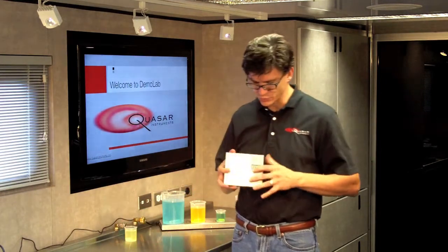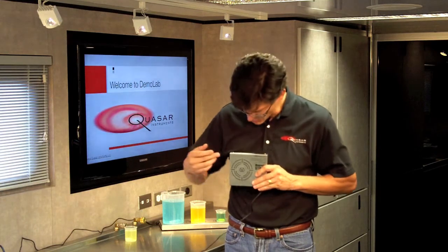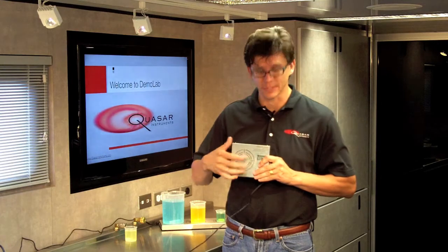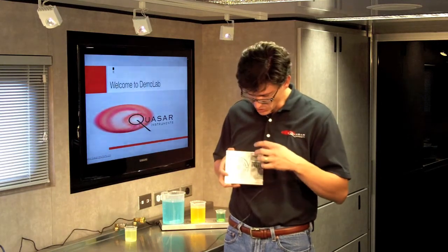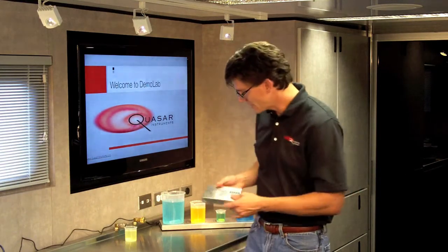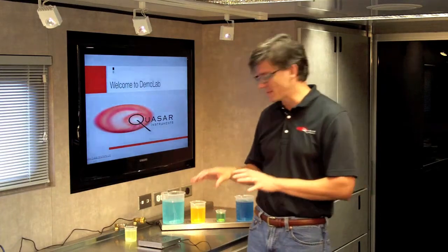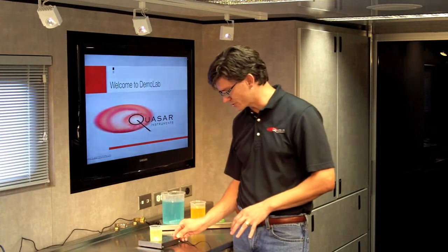What Hanil has done is replace the traditional motor magnet mechanism with a series of electromagnets located throughout the unit. They then use an electronic control box which controls the magnetic field at each one of those electromagnets, and directly manipulate the magnetic field to turn your stir bar.